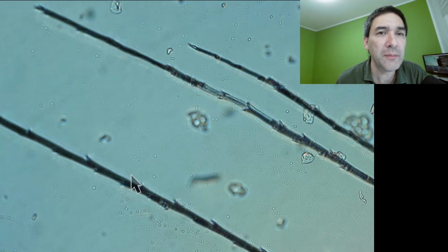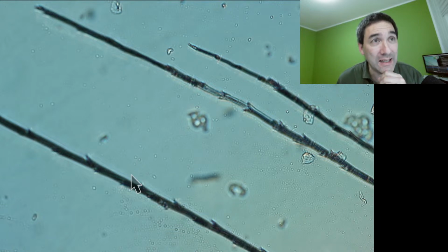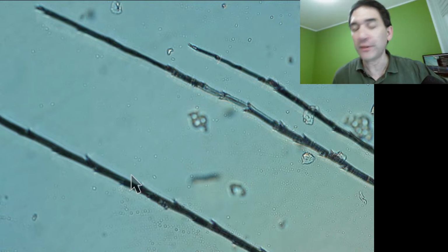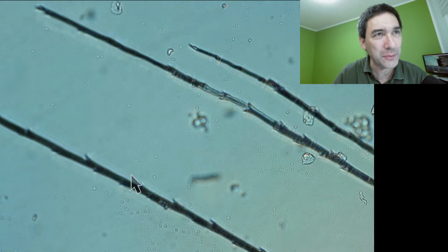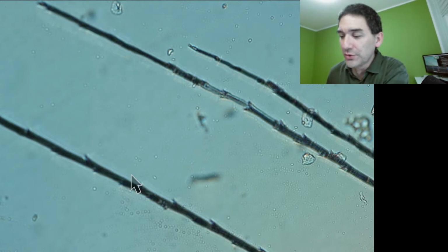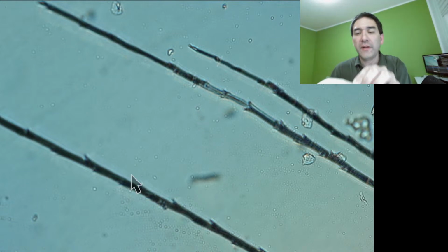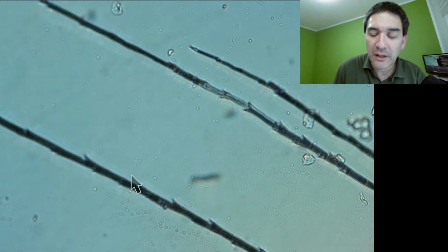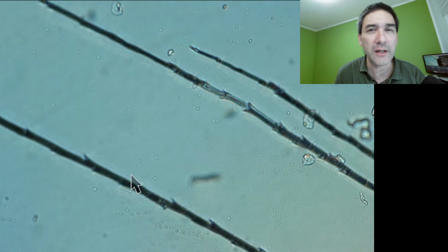So, do you sometimes see your own fingerprint on the slide? The answer is yes and no. I will tell you why. If you have a fingerprint on the slide, sometimes it is so big that you do not recognize it as a fingerprint. Generally, before I use the microscope slides, I dry wipe them to remove any grease or oil or fingerprint. But if there is indeed a fingerprint on here, then usually it's not only a fingerprint, but there's some other dirt and dust as well, which might be a little bit disturbing.